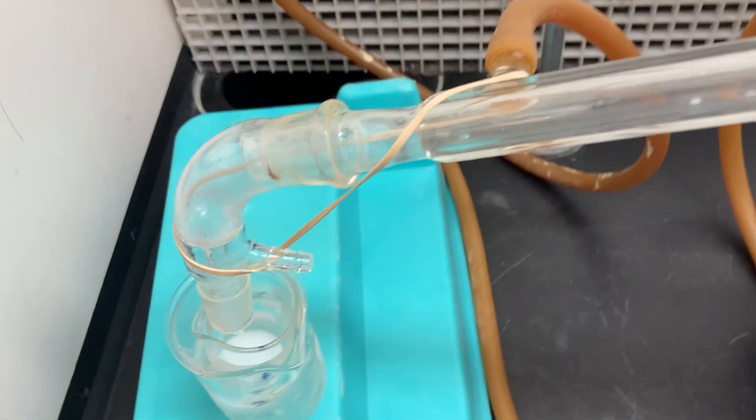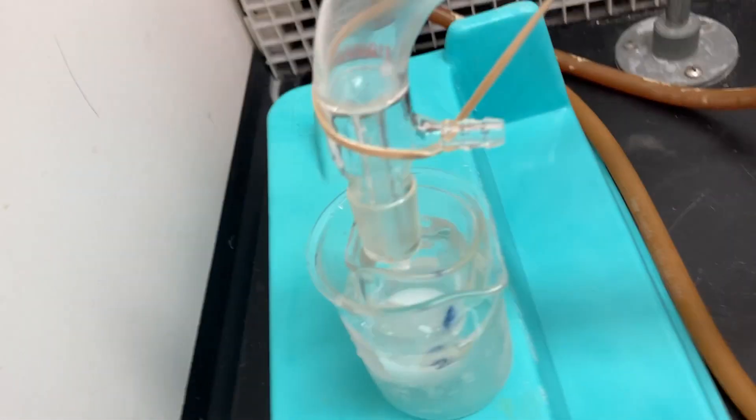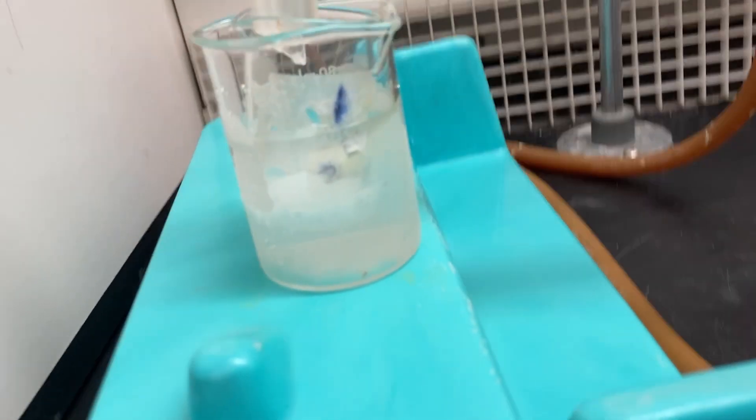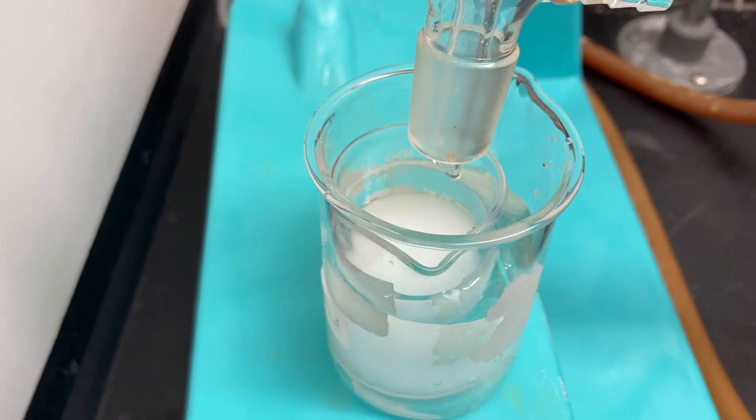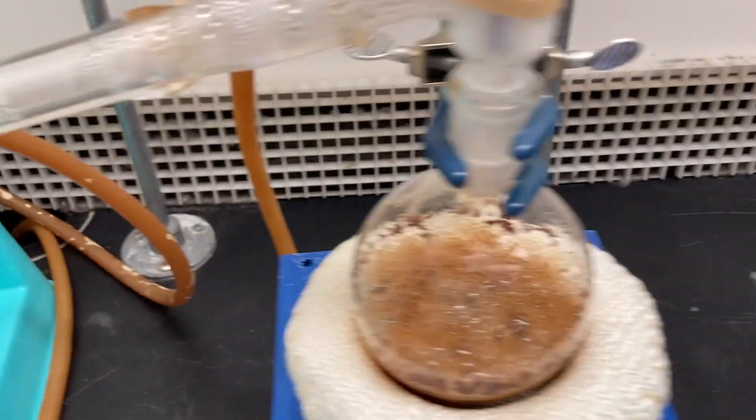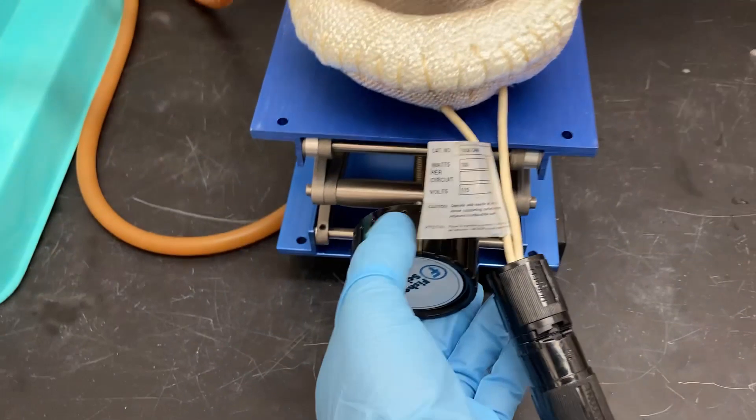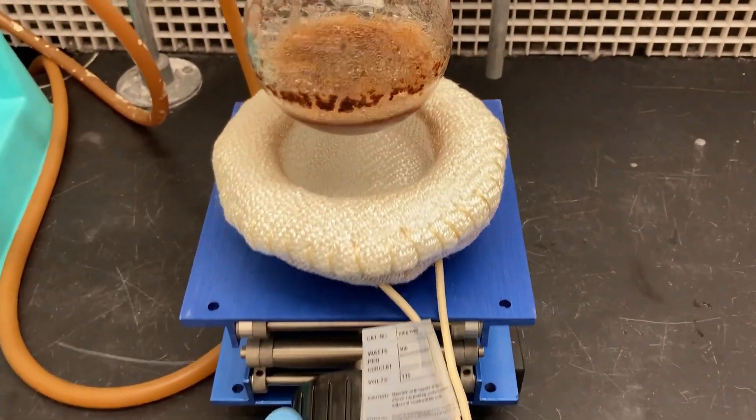Keep track of the volume of the distillate. Once we reach 25 milliliters, we'll be able to shut down the distillation. Make sure you lower the heating mantle away from the round bottom flask to prevent the spice from charring.